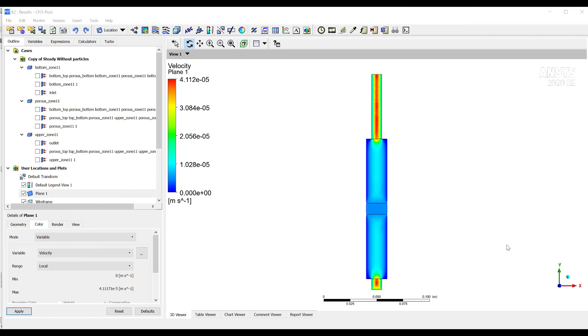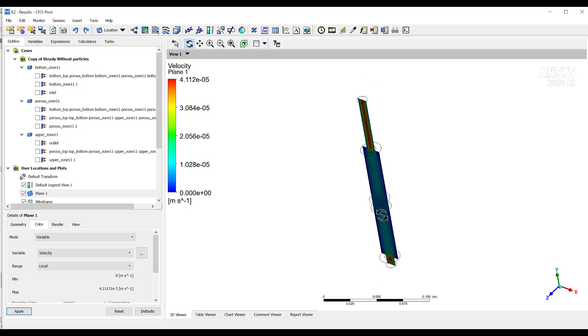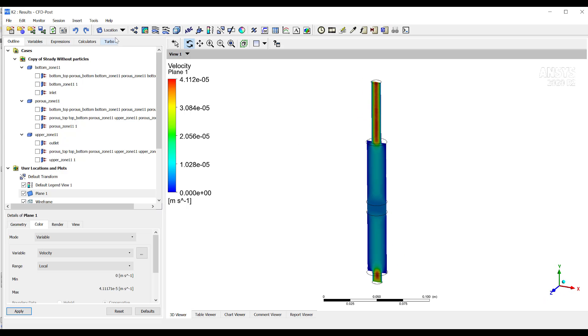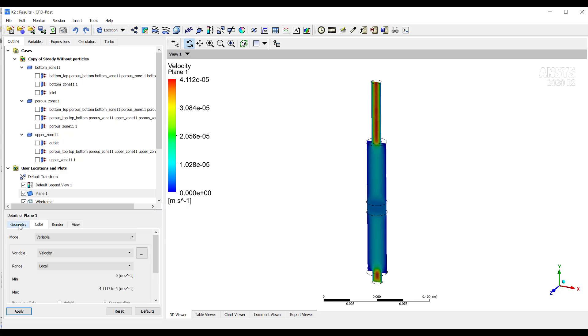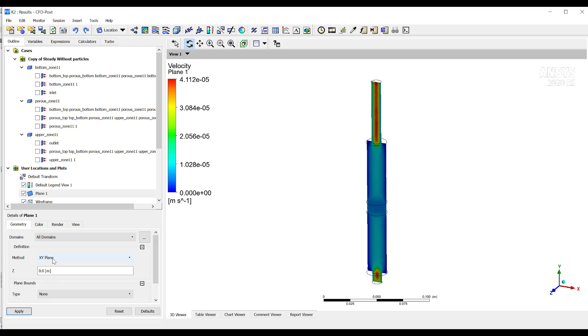Once the simulation converges, then we go to CFD Post to see the results. Then in this case, I create a plane, an XY plane. Remember, you can create it here in location, go to plane and you will have something like this open. Then you select the plane you want. XY is the one I want right now.